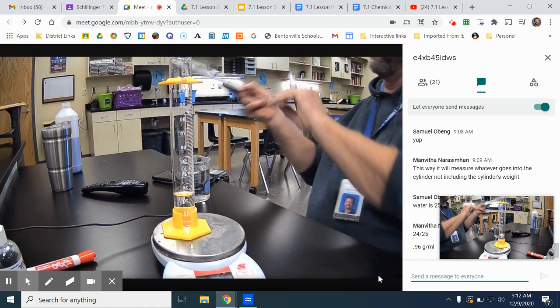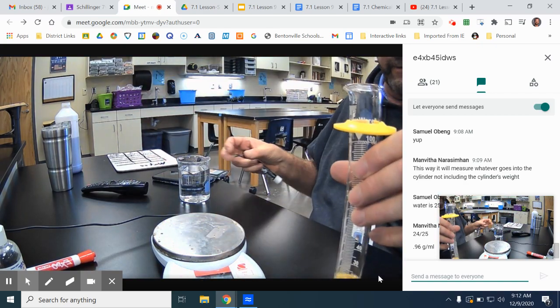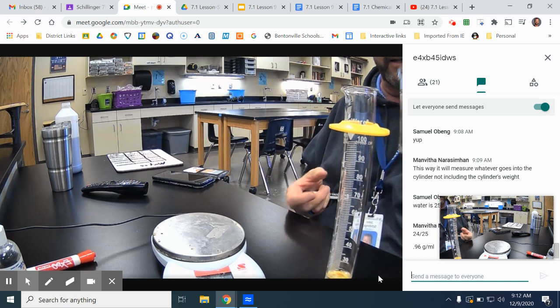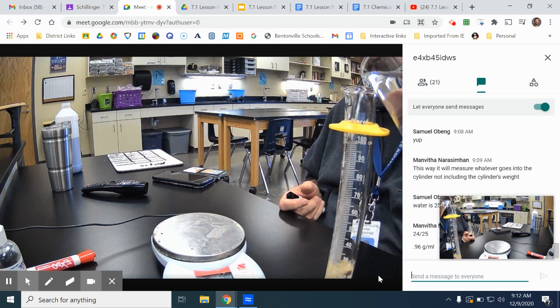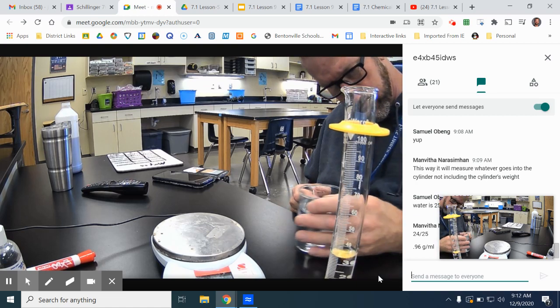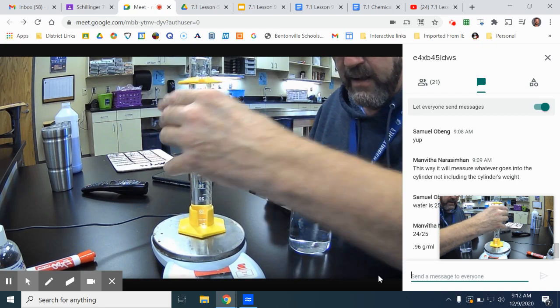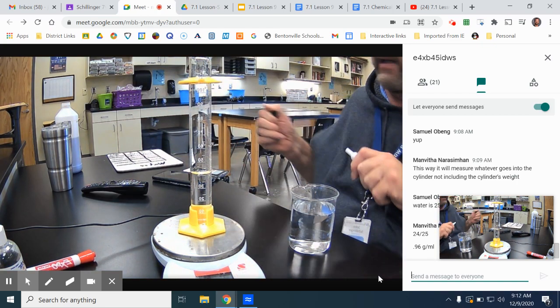All right. Now I'm going to go to 40 grams, or excuse me, 40 milliliters. So I have 40 milliliters.